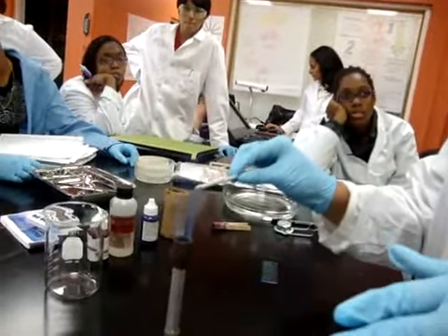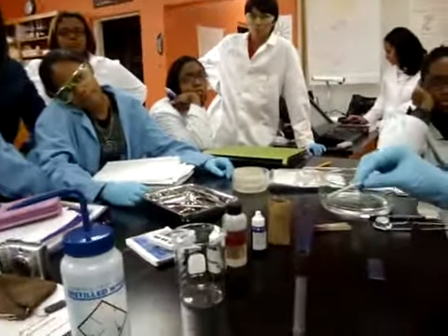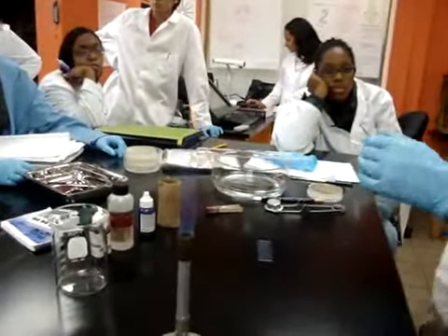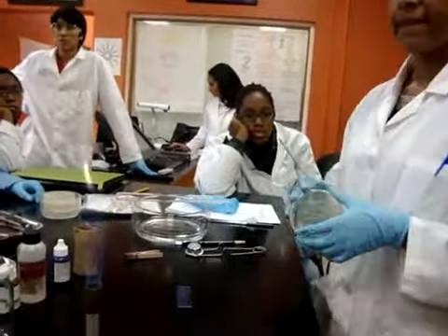So if you want it to be sterile, you have to burn it again. Isn't it not sterile because it's like in the air? Well, we can't really do anything about the spores in the air, so we do what we can. We do the best that we can. You don't do this under a fume hood like in medical?